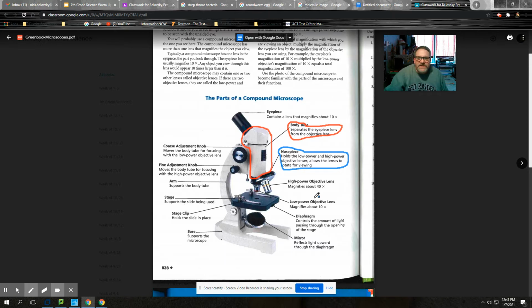Okay, so you hit pause and you have the nose piece in. All right, I'm going to use this same color. This right here is the nose piece. Okay, so my microscope real quick, I'm going to have to hold it real close. This is the nose piece. It's out of focus a little bit. This is the nose piece.